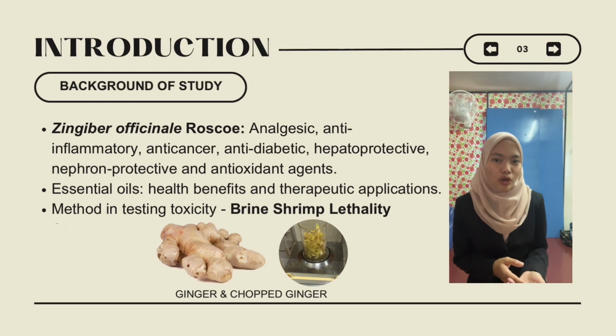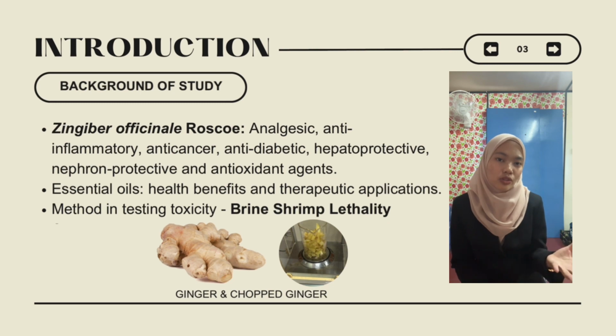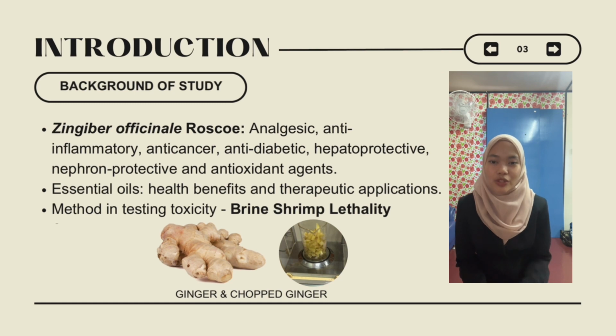Ginger or Zingiber officinale Roscoe is well known for its good properties as it is analgesic, acts as anti-cancer and also as an antioxidant agent. Ginger is also widely used as essential oil for centuries upon its health benefits and therapeutic applications. So in this study, we will approach how to assess ginger's toxicity through brine lethality assay.